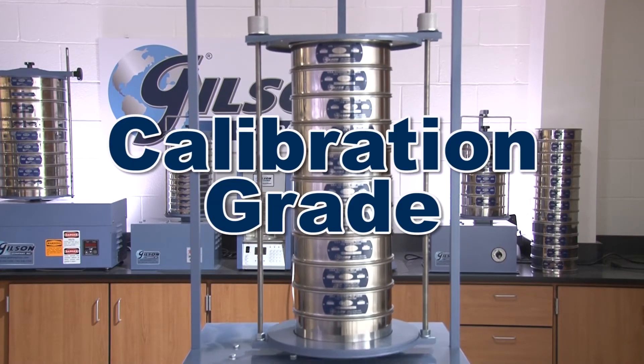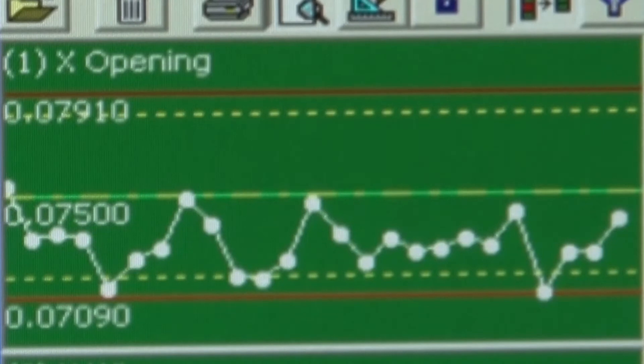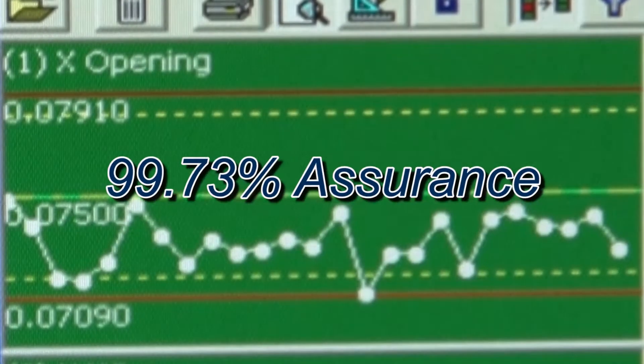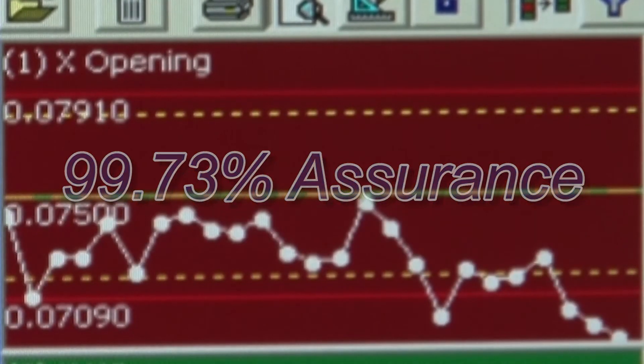Calibration grade sieves should be used in applications where a very high degree of accuracy is required. Calibration grade verification measures two to three times more openings with a 99.73% assurance that your test sieve or screen tray meets ASTM or ISO standards.